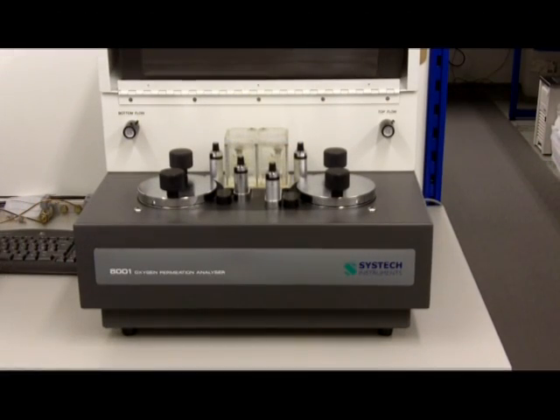The analyzer only needs oxygen and nitrogen supplies. It does not need any expensive gas mixtures. Temperature can be set between 5 to 50 degrees centigrade. Humidity range from 20% to 90%.